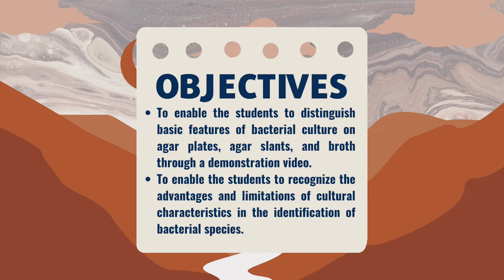Our agenda for today is to enable us students to distinguish basic features of bacterial culture on agar plates, agar slants, and nutrient broth through a demonstration video. Secondly, to enable the students to recognize the advantages and limitations of cultural characteristics in the identification of bacterial species.